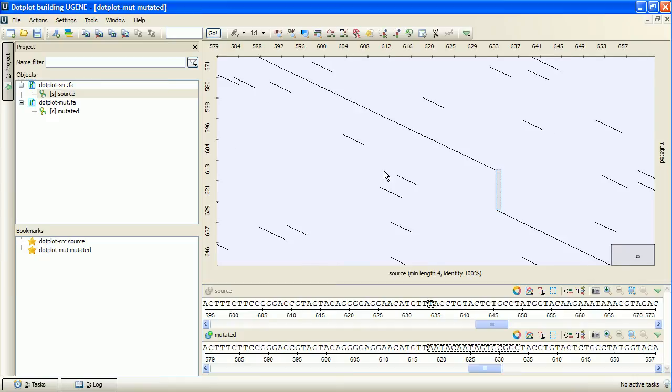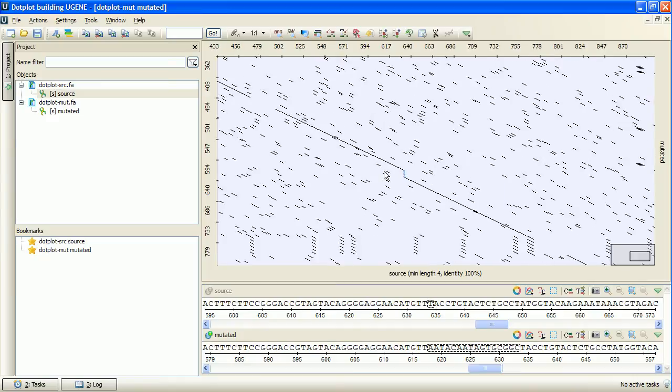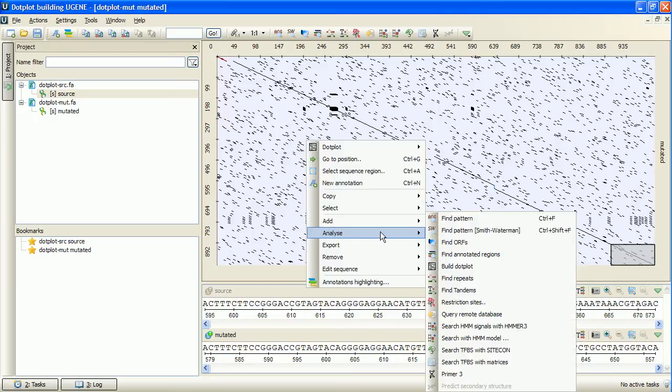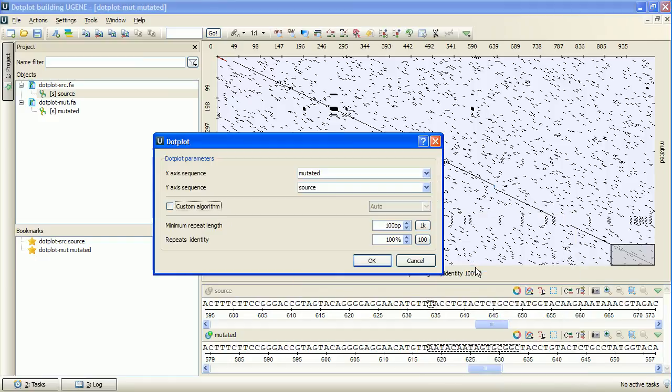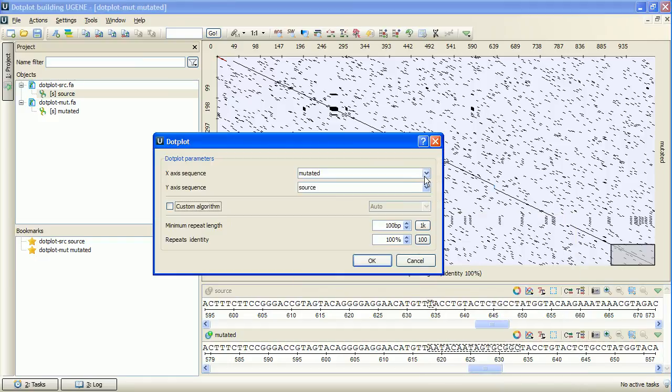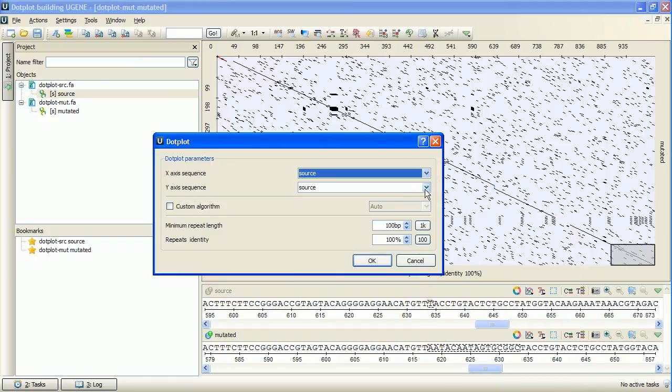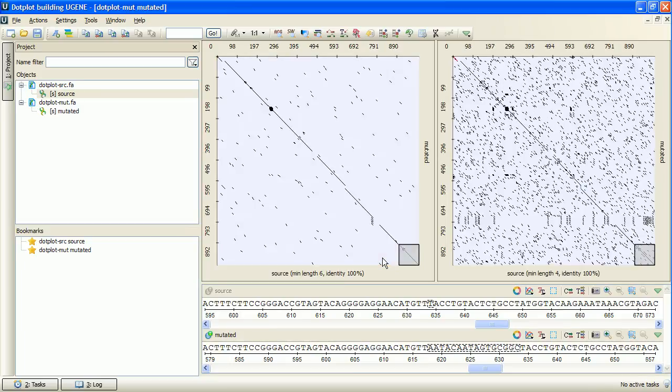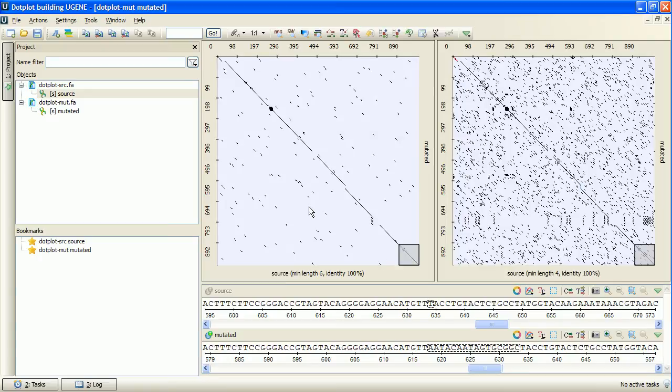That's what we can read from this particular dotplot. In UGENE, it is possible to compare several dotplots. For instance, I can build another dotplot for sequences from the opened multiple sequence view. The second dotplot is built and displayed at the same view and ready to compare.